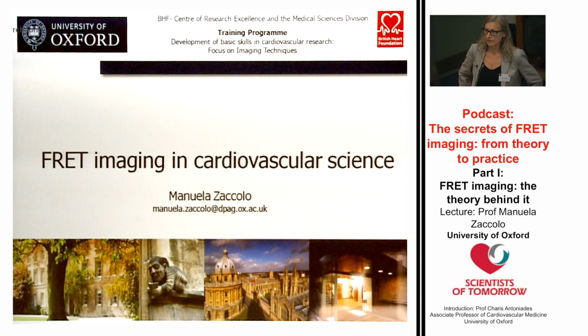So what I would like to do today is to, first of all, give you a very simplified description of what FRET is and a description of how we can use this phenomenon to design and use genetically encoded sensors to measure biochemical events that happen in intact cells, so in the complexity of the intracellular environment.